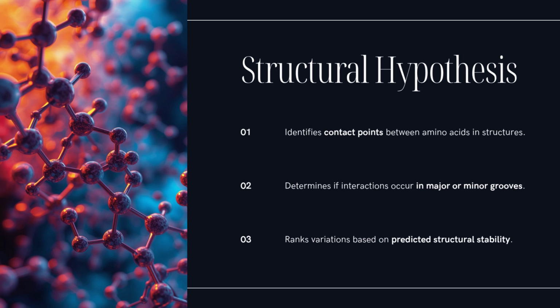Okay, let's take that protein DNA example. I put in my sequences, I hit Run, I get a structure back. What does that output actually tell me as a researcher? So for that transcription factor binding DNA, you'd immediately get a 3D picture. You can look at which amino acids are making contact with the DNA bases. Does it bind in the major groove or the minor groove? An initial structural hypothesis. Exactly. You can also check the confidence scores, like the average pLDDT for the DNA binding domain, to see how reliable the model thinks that part is. It lets you sketch out mechanistic ideas really fast.